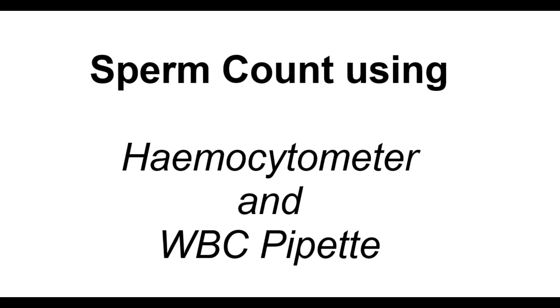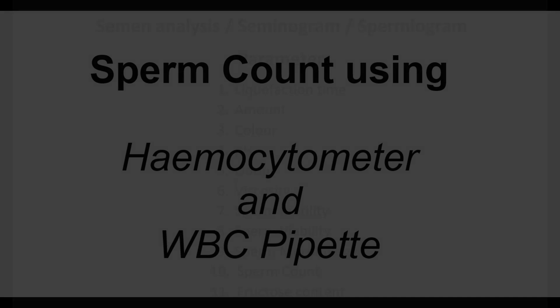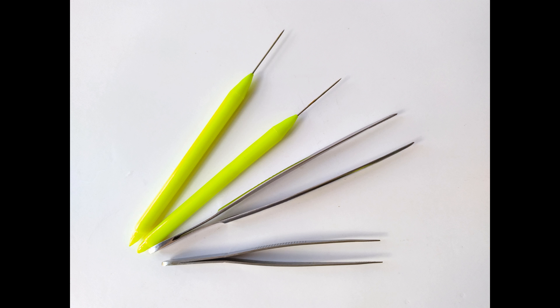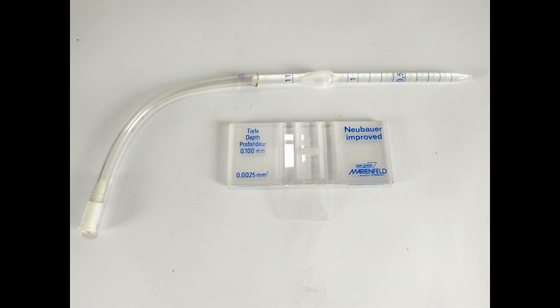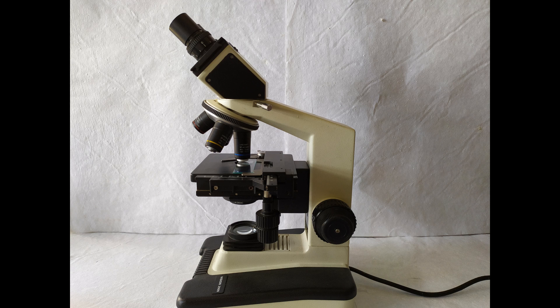In this video, we will be using the hemocytometer with WBC pipette to perform the sperm count. For this experiment, you will need the following: freshly collected human semen sample, thumb forceps and pins, hemocytometer counting chamber with WBC pipette, semen diluting fluid, and a compound light microscope.